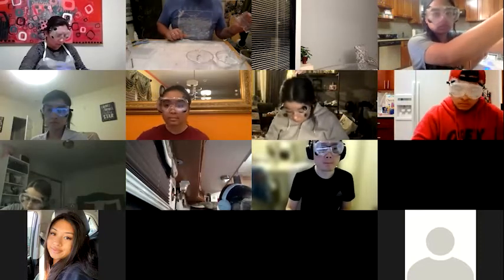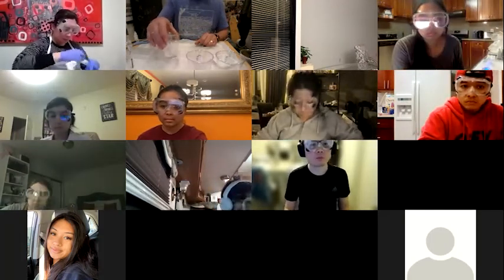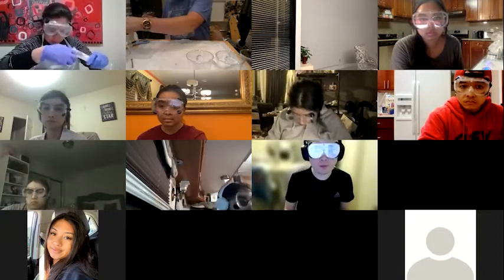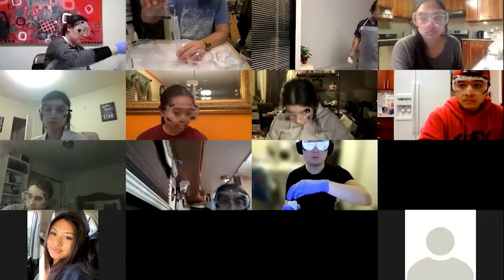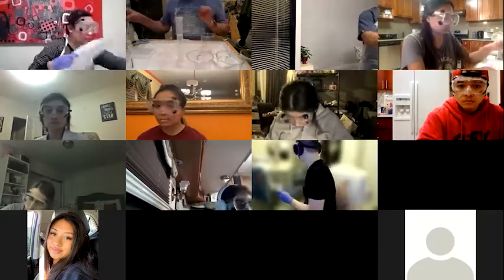All right. I think that's everything in solution now. Then we just pour it back into the 50, and then top it up to 50 mils with water.